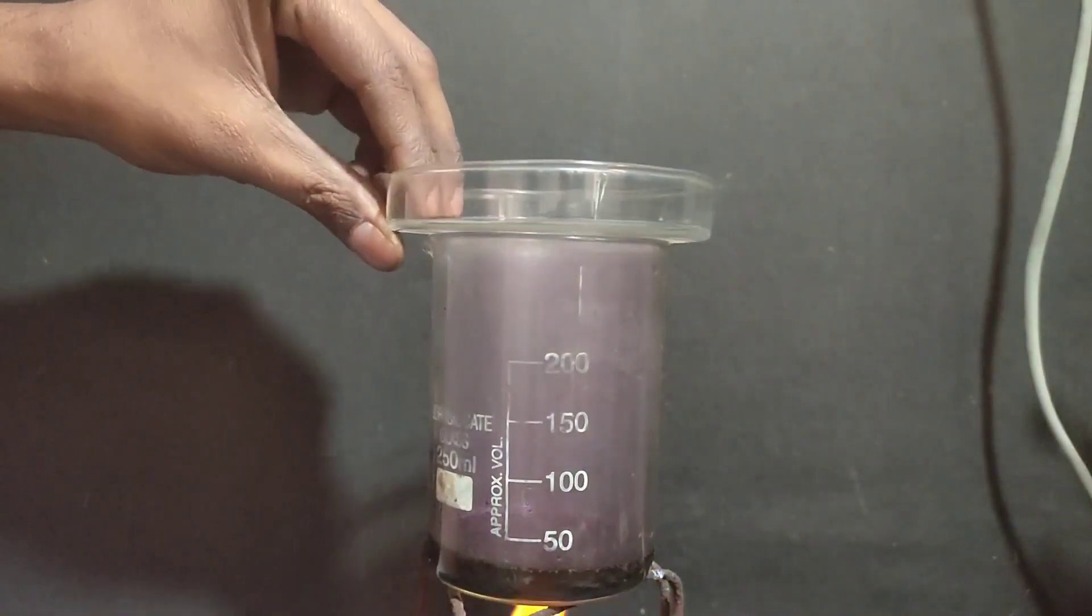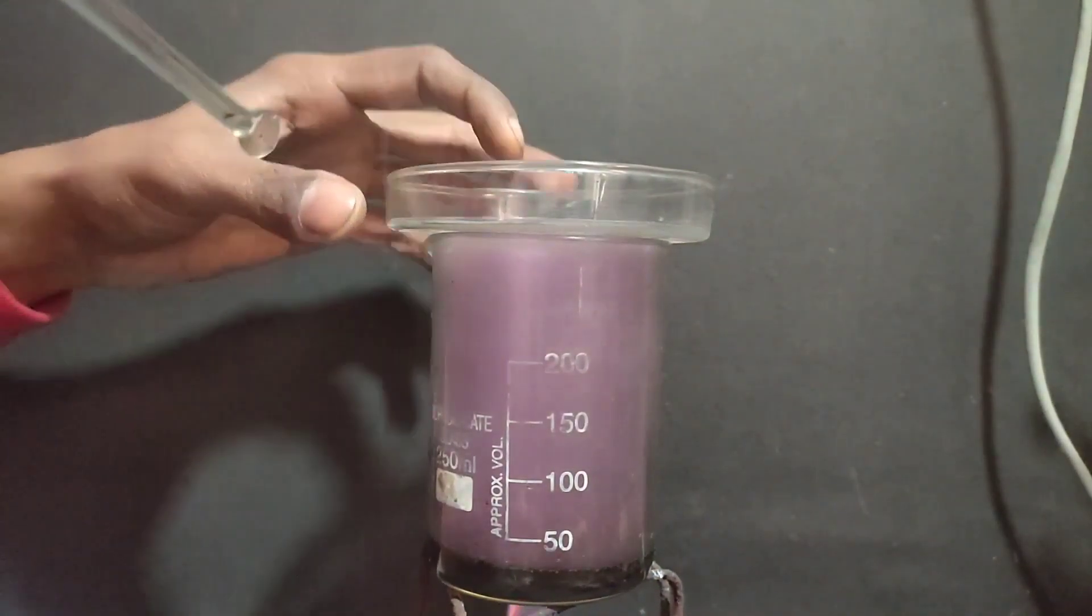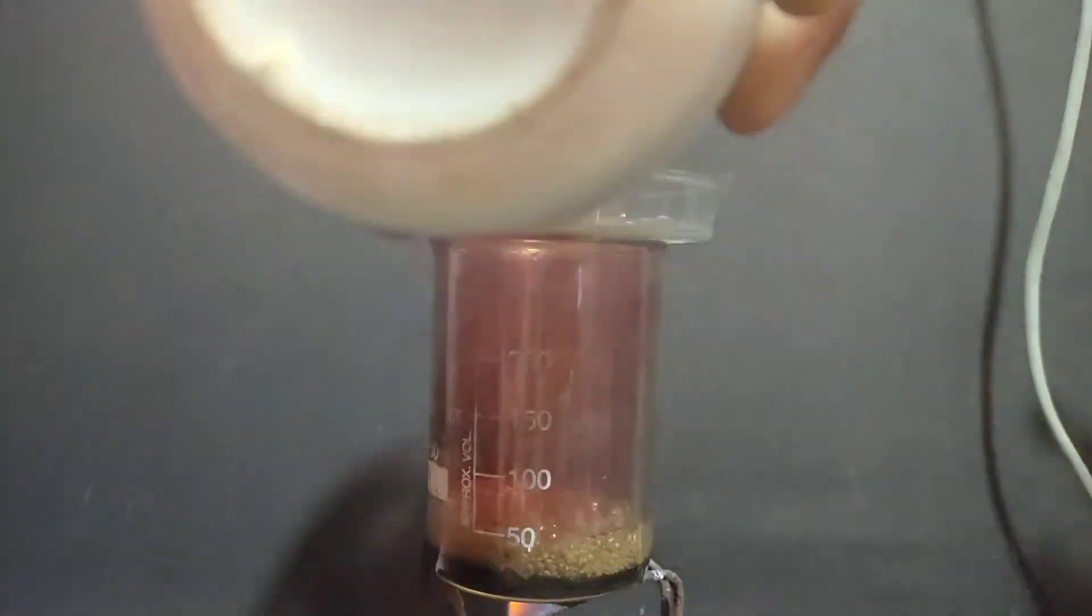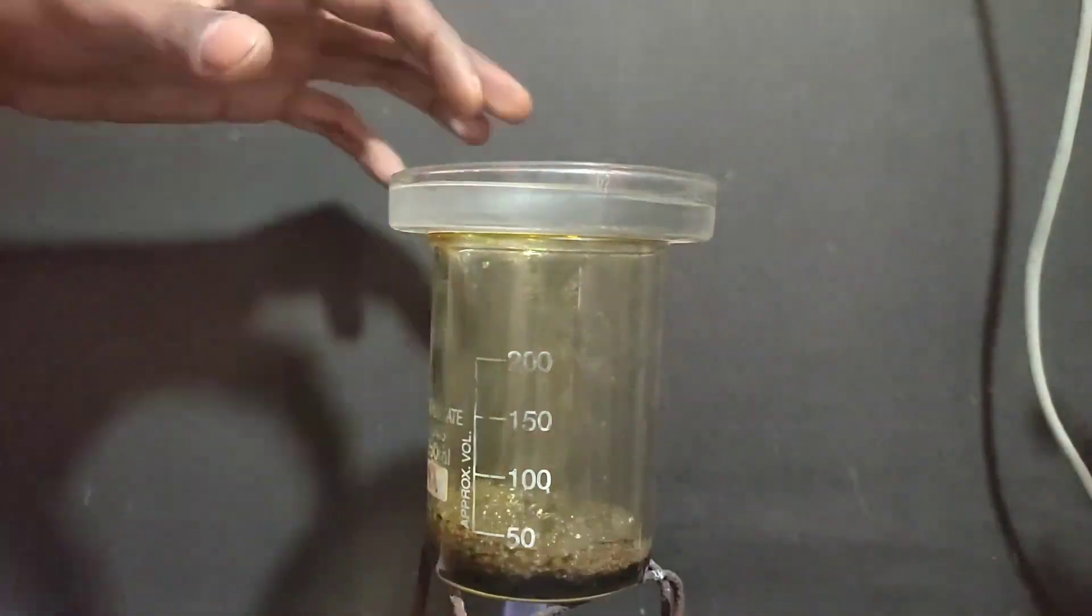But I added around a ml and a violet vapor of iodine started evolving. So I covered the beaker with a petri dish in which I added water, but no iodine sublimate was formed.